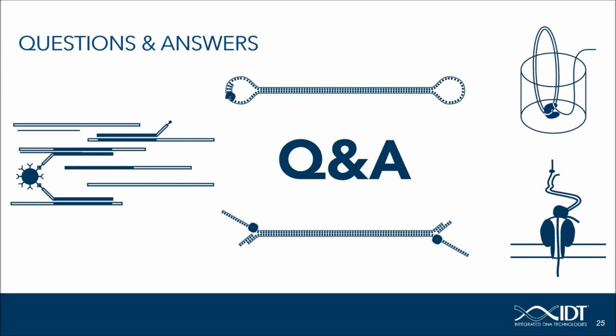With the buffer that we exchange for the beads, we actually have a very strict cutoff of around 6,000 base pairs in which we do size selection. And you cannot achieve this with standard AMPure beads. Thank you for this answer.